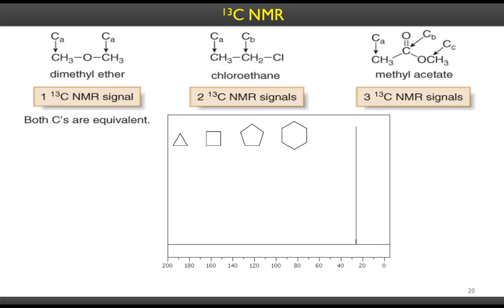You have to collect your clues from many places and then sit down with all the data that you have and nail the culprit. Same is true with this structural analysis. You collect some information from carbon NMR, some information from proton NMR spectroscopy, and some information from mass spectroscopy, functional group information from IR spectroscopy, and then deduce the molecular formula and then write the possible structures and see which one accounts for all of them.